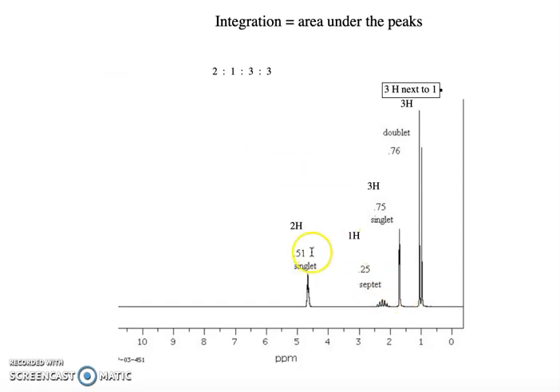And we would do the same kind of analysis for all of the other peaks until we had pieces that we could put together to find the structure of our compound.